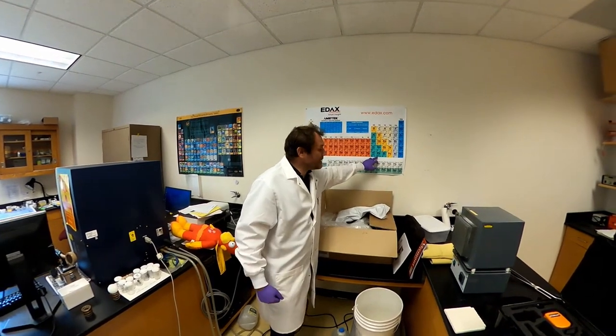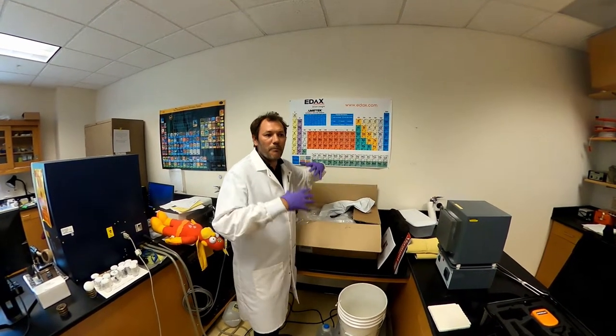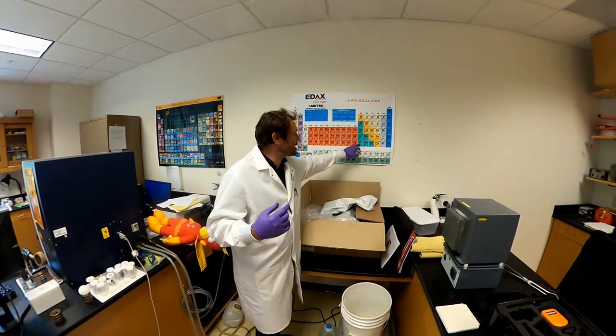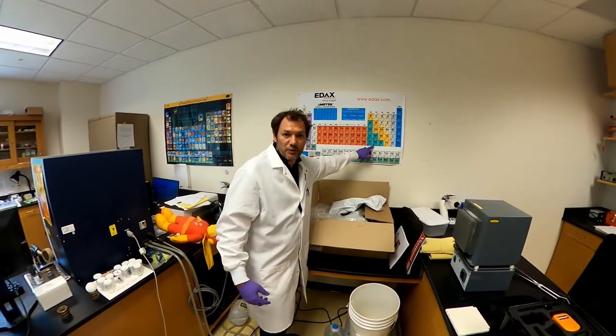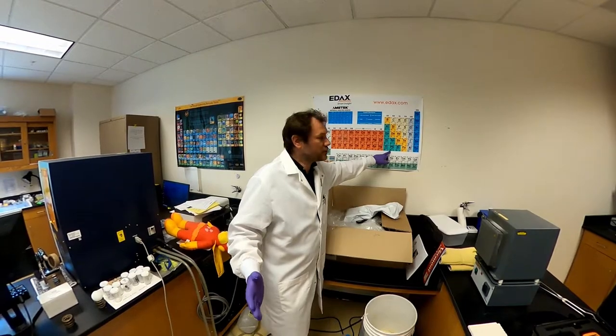when we excite by X-ray, this sample that contains lead. So if we find any peak basically of massive amounts of energy that is released at this particular values of kiloelectrovolts, and I won't enter into details there, we know we have lead.